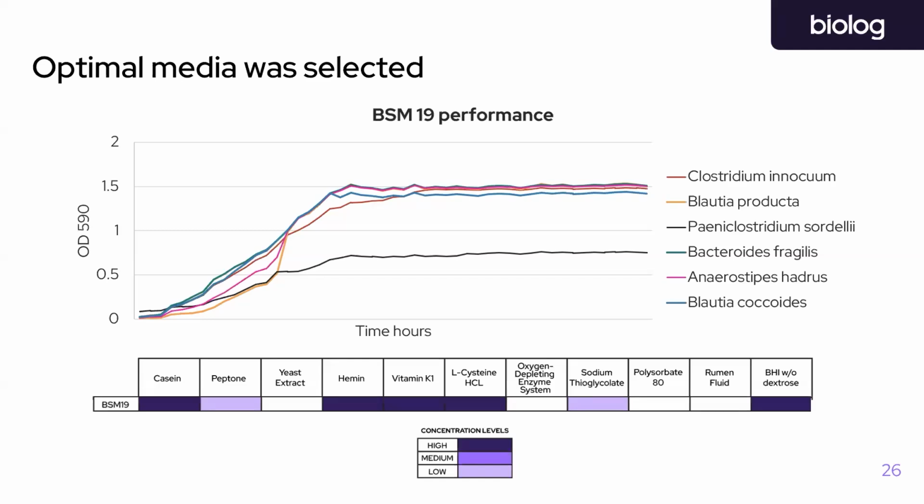How do the plates and everything during growth stay anaerobic? Is there a need to put the plate reader in an anaerobic chamber? To put the plate reader in an anaerobic chamber for a 12-hour period or even a 24-hour period is not really necessary based on our results. However, for extended periods, we do expect things like diffusion of oxygen to permeate plate seals.